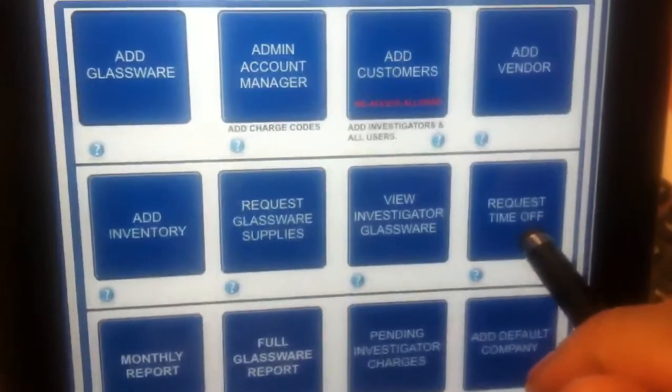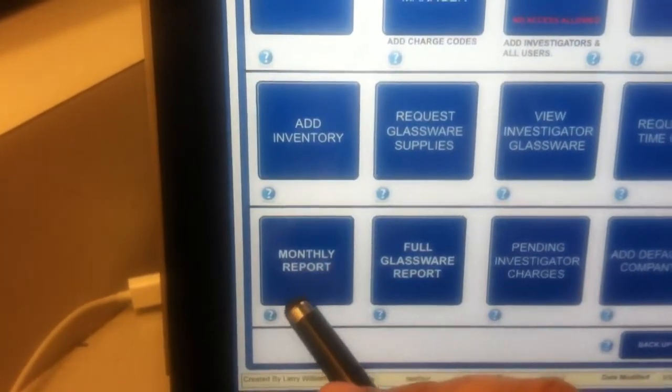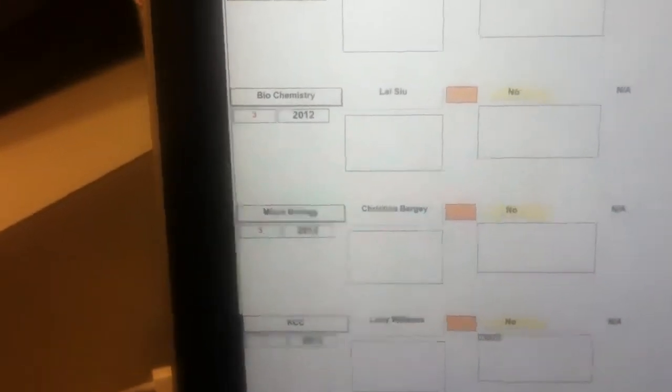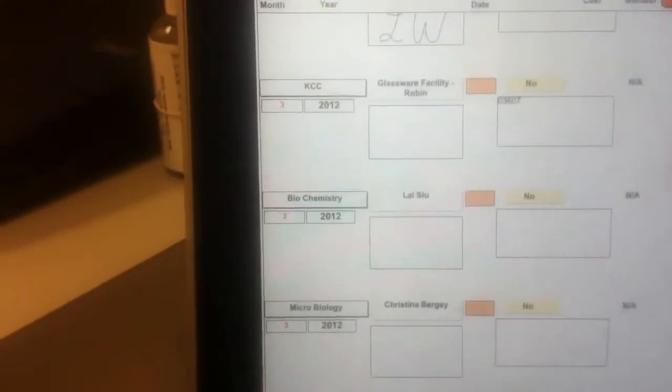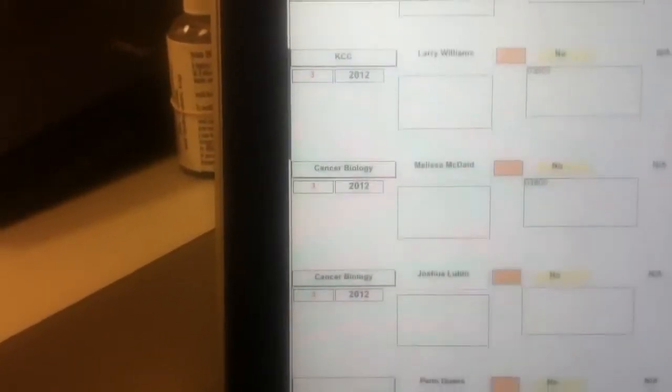This right here is request days off or time off. That's not completed yet, but it will be there. This will give you a monthly report. This will give a monthly report of all the glassware that's being washed, and this lists everything.